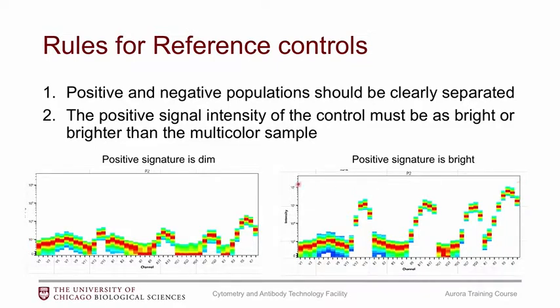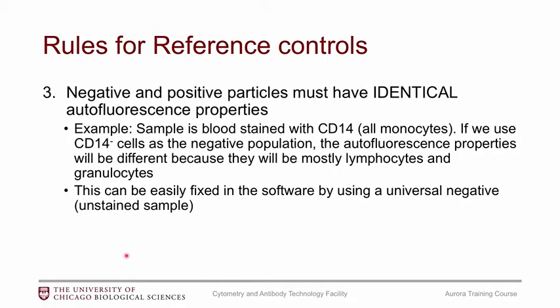It's really better if you can get a really bright, separate positive population to give the algorithm the most information to do the unmixing. You can also imagine that if your reference control has a dim signal but your sample actually has a much brighter signature, the algorithm is going to have a hard time unmixing. Whereas if you use the bright signature as your reference control, it will know this is just a dimmer version and unmix it properly.